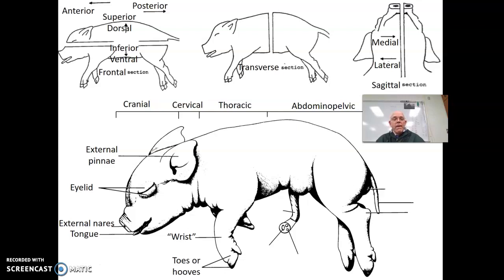Now, I forget if I did the umbilical cord. No, we did. Okay, so let's go ahead and go in order here. We have the umbilical cord. The umbilical cord, of course, was attached to the mother pig, and this is where all nutrients, food, and all that sort of stuff had to come through.